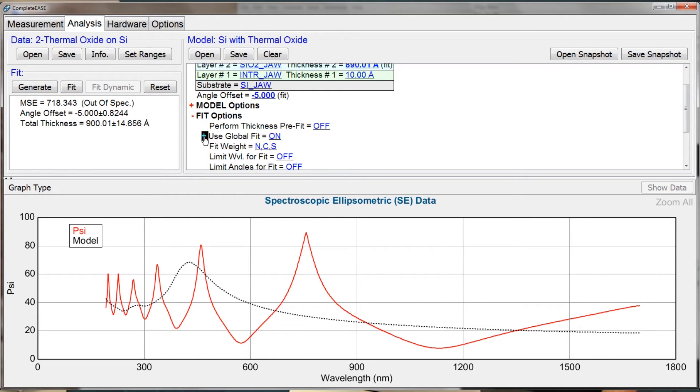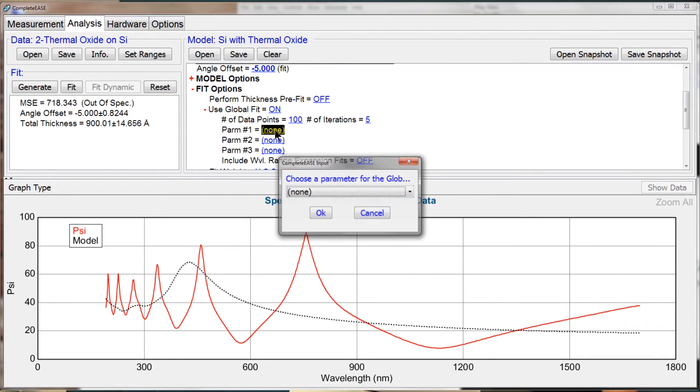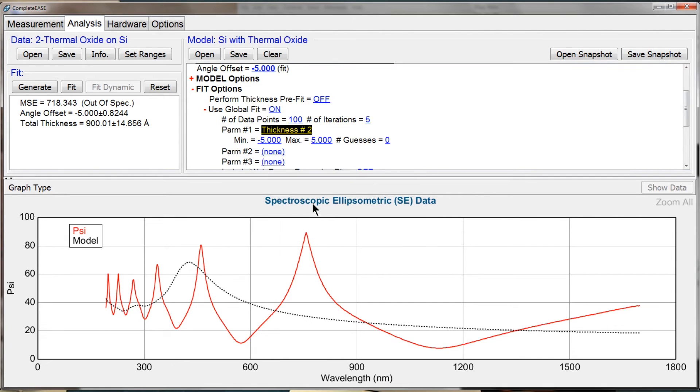And let's expand the global fit. You'll notice it's right below the thickness pre-fit. And when I turn that on and expand it, it allows me to type in the thickness as one of my global search parameters.